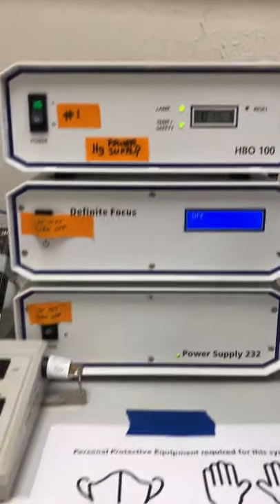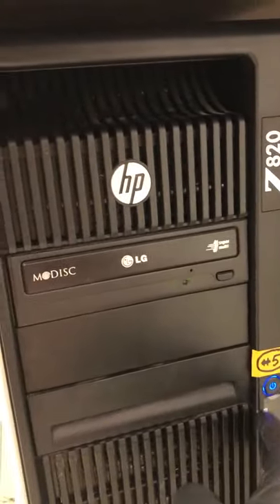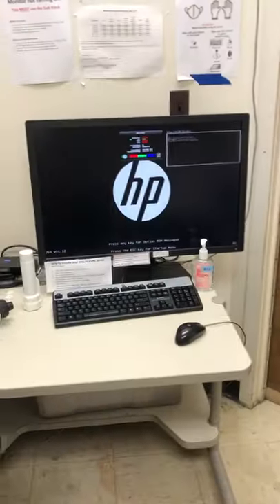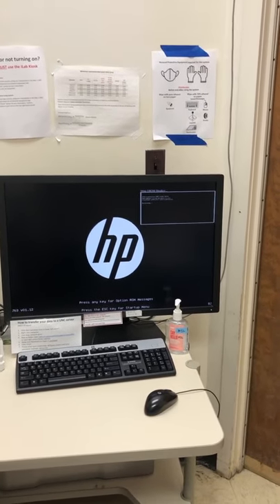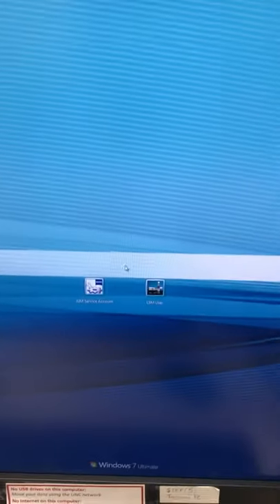There we go — that's what it should look like. The next step is to turn on the computer and wait for the MSL login. You can start the computer from here. It is very important to wait for the MSL login. If you move to the next step — which is to turn on the component switch — without waiting for the proper startup of the computer, the system will fail much later. Please wait, otherwise you're going to cause trouble for yourself later on. This is the screen you're looking for; you want to get to this point before going to the next step.